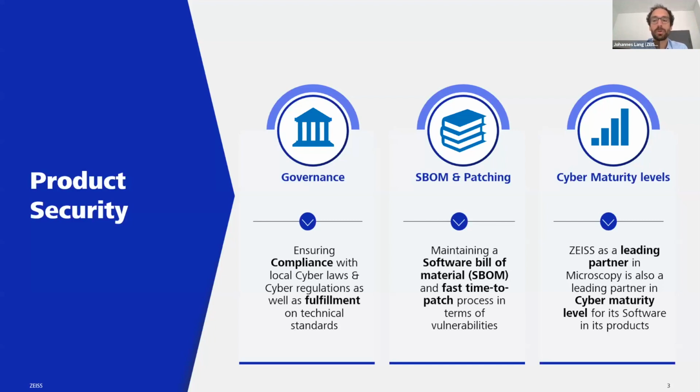At the same time, we're also actively providing security documentation. So we're not only providing user manuals for our applications on the computers, or for predictive service for example, but we are also providing security documentation.